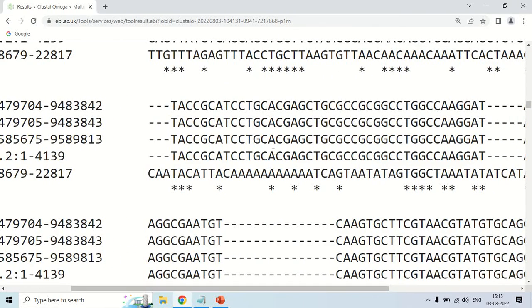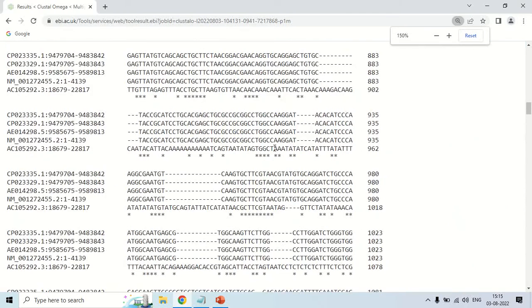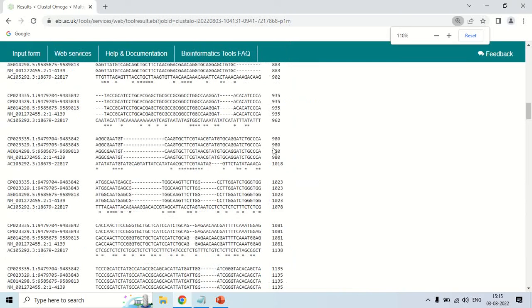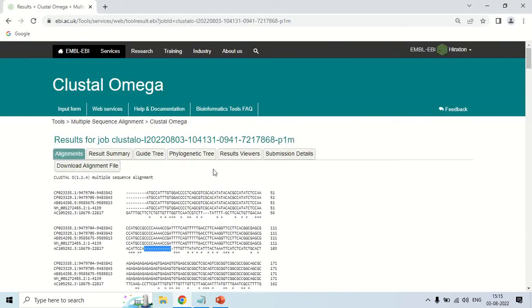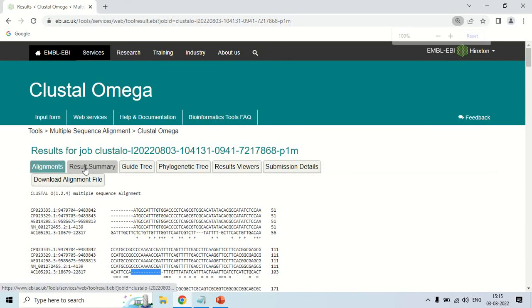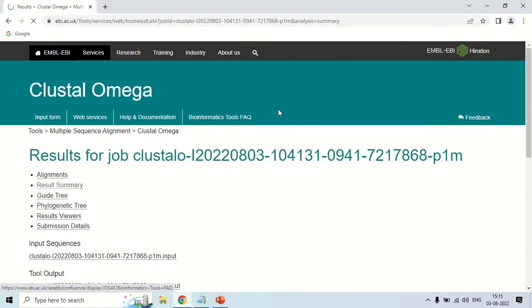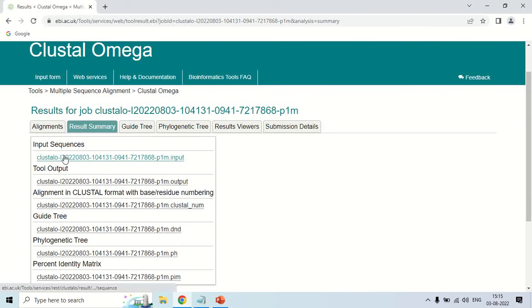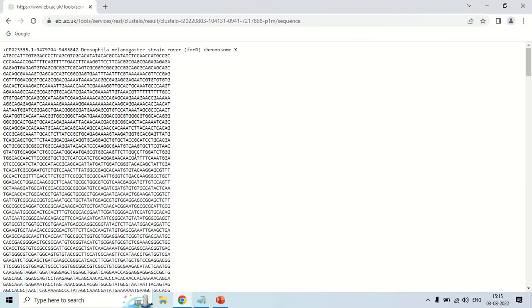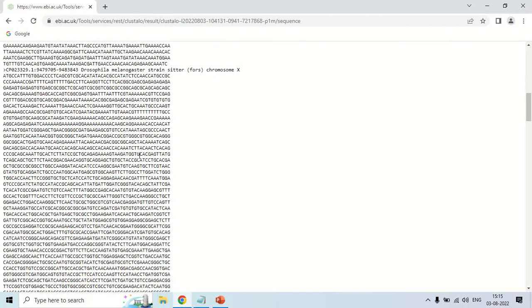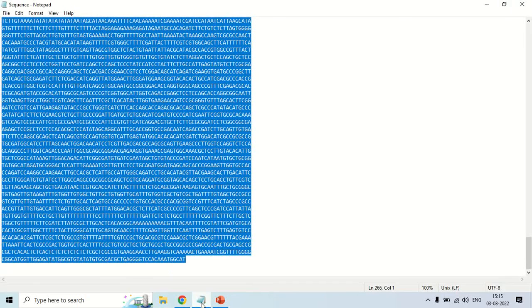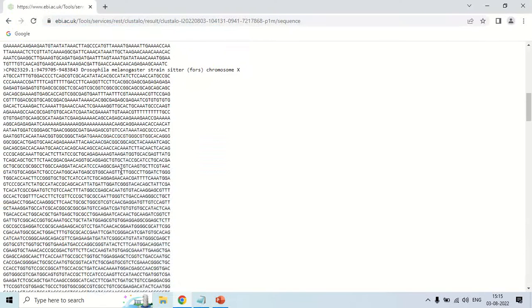This is the alignment sequence. Now let us move to the options above — the 'Result Summary' tab. If you click here, it will show you a summary of all the results. The 'Input Sequence' tab, if you click it, will bring you to the page showing the input sequences — those are the sequences we gave to the software for the multiple sequence alignment, i.e., the sequences we copied and pasted.